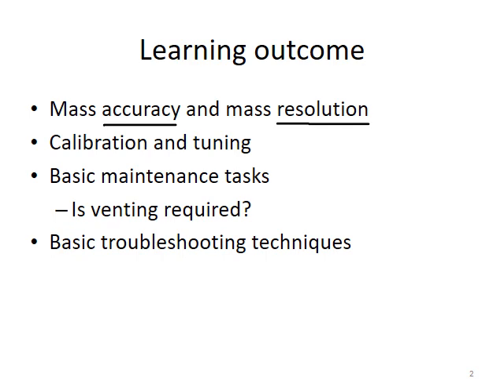In Q12, there is an operation that you can do on a daily basis to bring back the perfect accuracy. This operation is calibration. So calibration, you can do it on a daily basis, but there is another one which can not only bring back your accuracy, but also bring back your resolution. This is what we call tuning. So these two you also need to grasp.